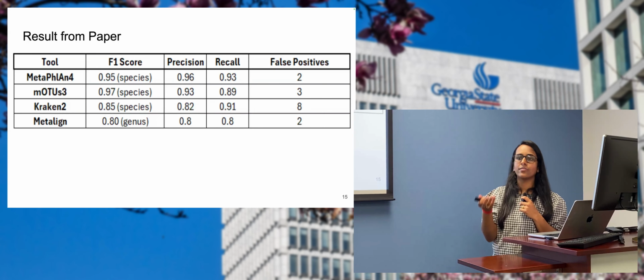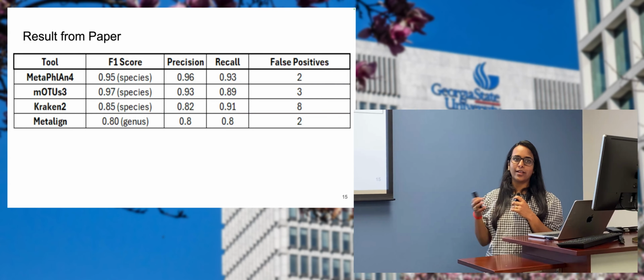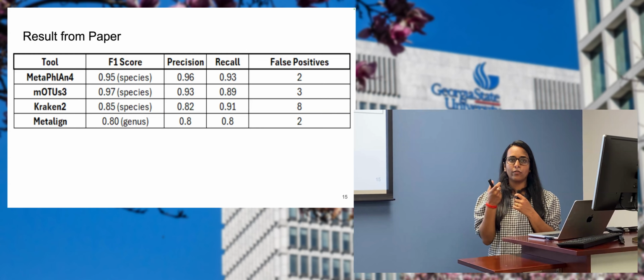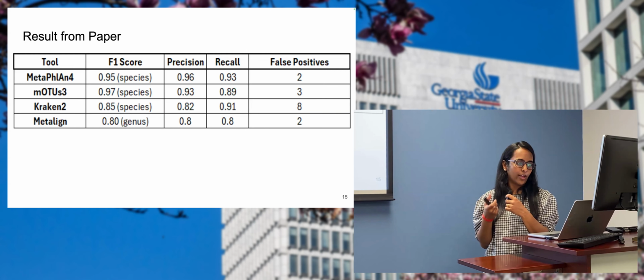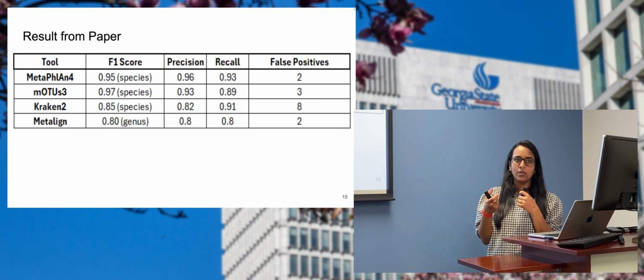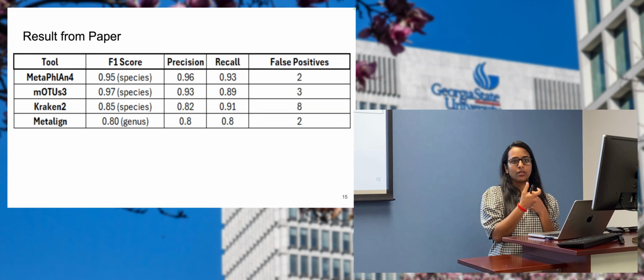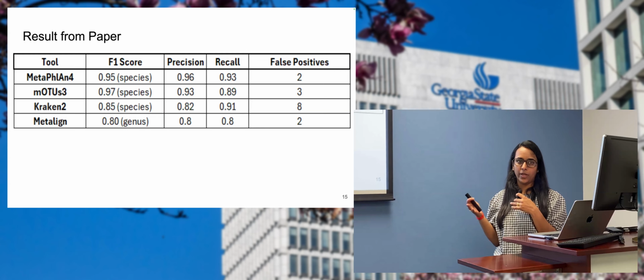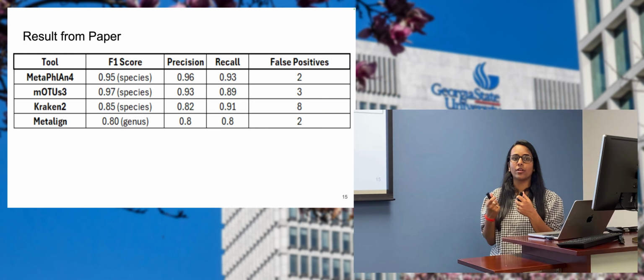So as we said, for the reference genome, we need to decide which particular species you need. If you need viruses, you will try to get the reference genome against your sample environment genome, so you will get more accuracy because the data set is not that big. So you'll try to get the k-mers that will align, so you'll get more accuracy.